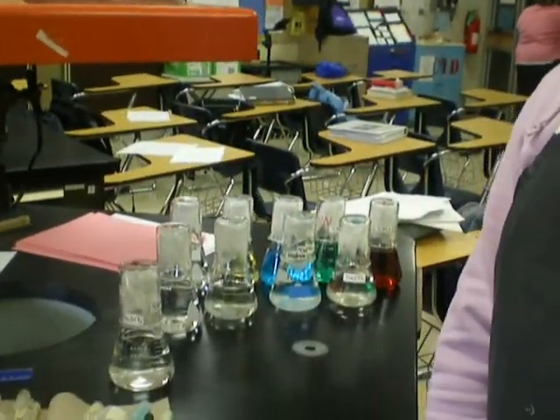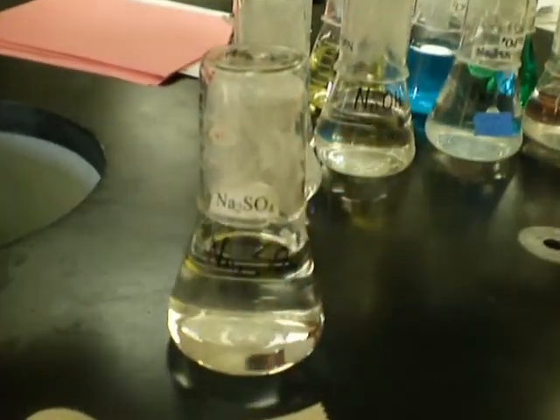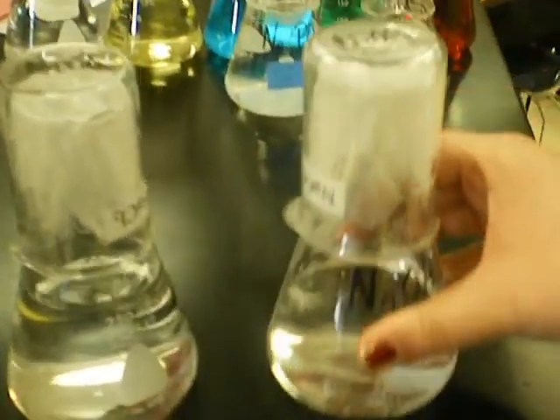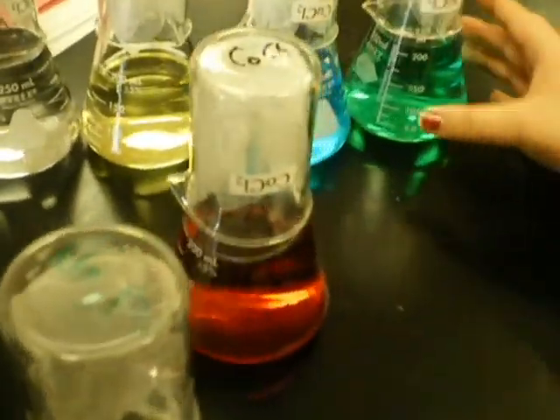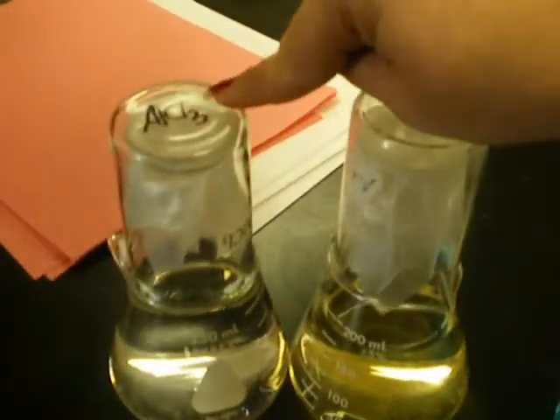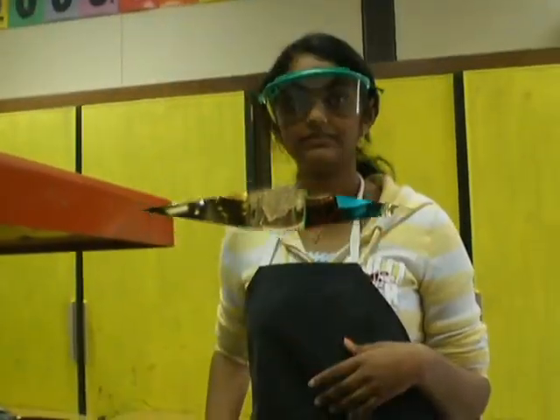Okay, so this is Neeta, and she's going to introduce the colors and the solutions. Make sure you notice the names and colors of the chemicals. This is sodium sulfate. This is barium chloride. This is sodium hydroxide. This is sodium phosphate, sodium carbonate, cobalt chloride, nickel chloride, copper chloride, sodium iodide, and aluminum chloride. Make sure you know the colors.